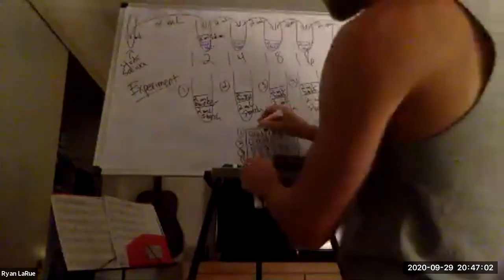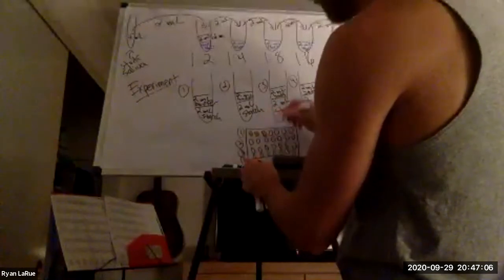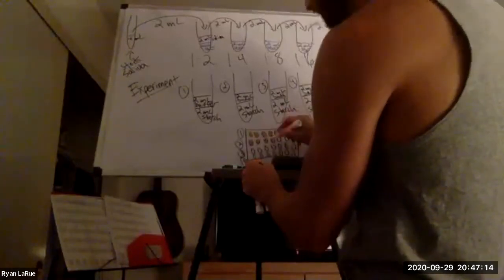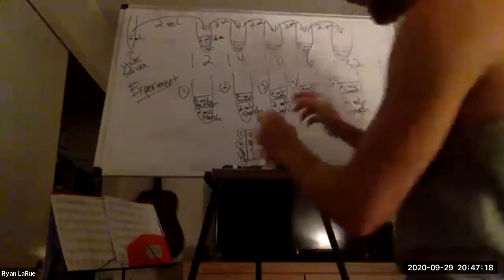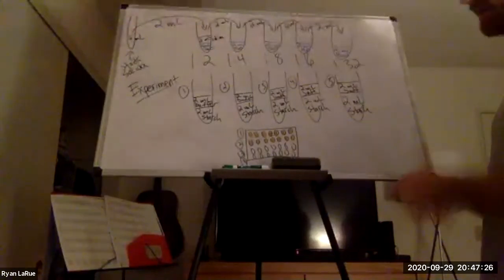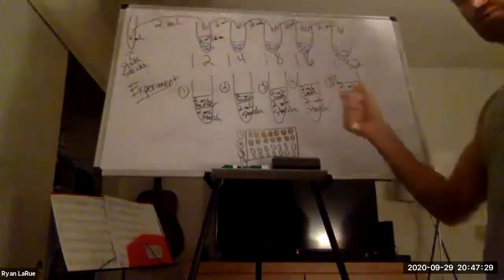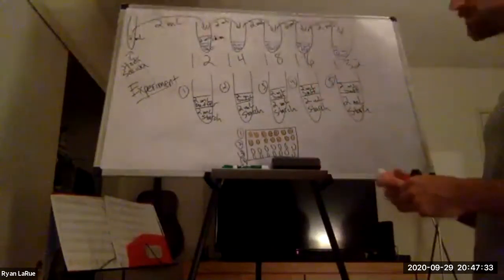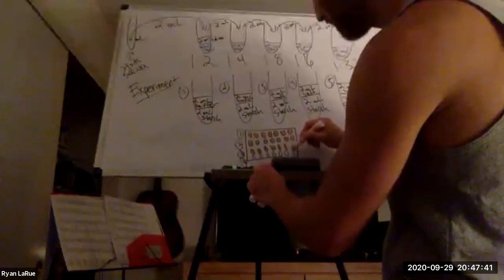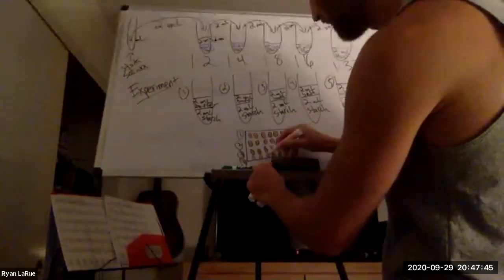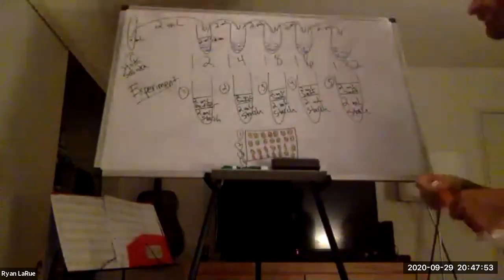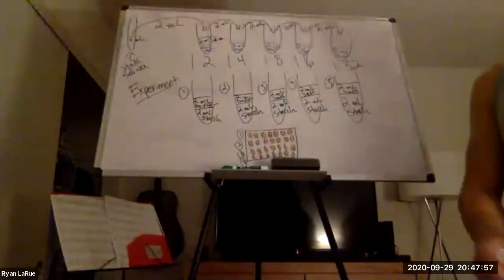What we're going to do is add 100 microliters of Lugol's in each one of these wells. I'm not going to do all of them. Since we only use five rows, you would only fill the first five rows, right? So on. You have the, I'll leave that actually blank for a specific reason. Okay. So pretend I just filled in all my rows with Lugol's. You have this grid of Lugol's. Eh, might as well. Let's do it really quick. Quick, quick, quick. I like having the complete texture. All right. There it is. 100 microliters each. All right. Now we're ready. Now we're ready to do the actual experiments, all right? And it's a timing thing. It's a very sensitive sort of timing thing. So this is what happens.